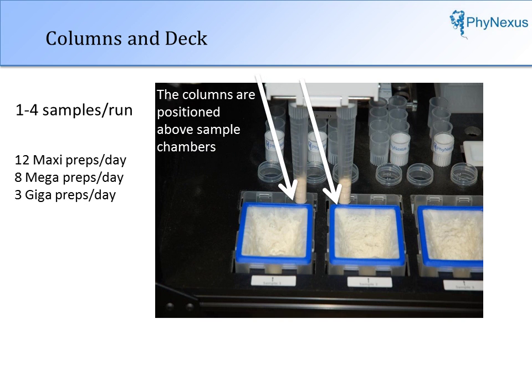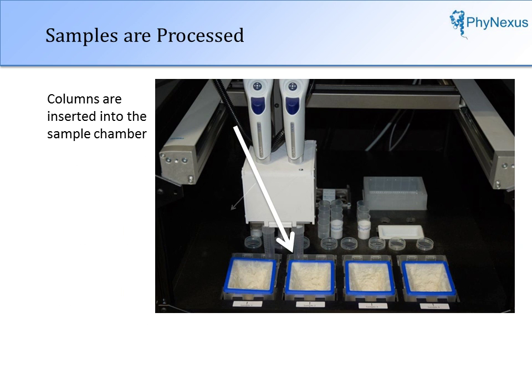The columns are positioned above the sample chambers and then inserted into the sample chambers. Precipitated cell pellets from any culture media, including high-growth media, may be used. Any growth conditions can be used, including overgrown cell cultures.